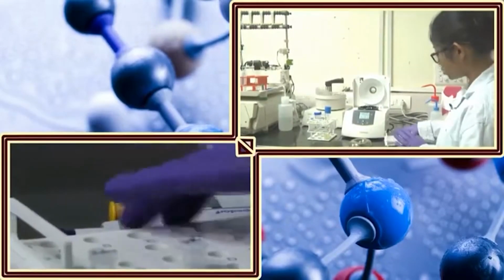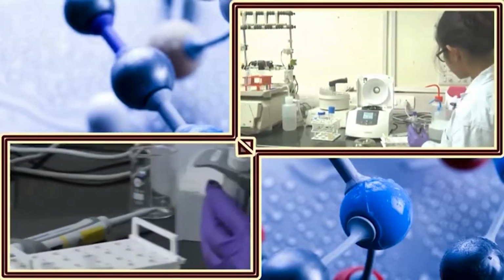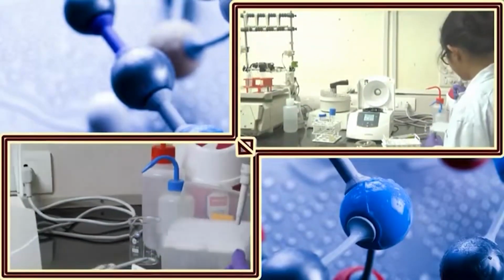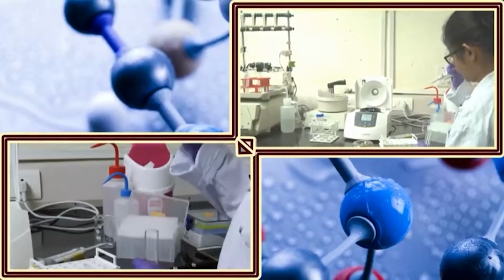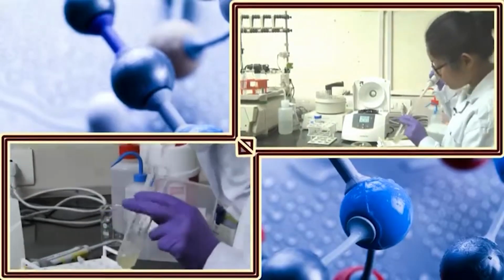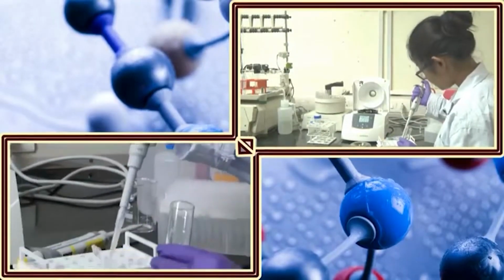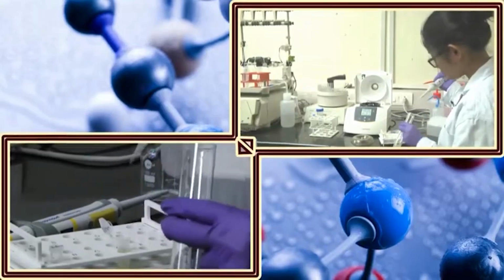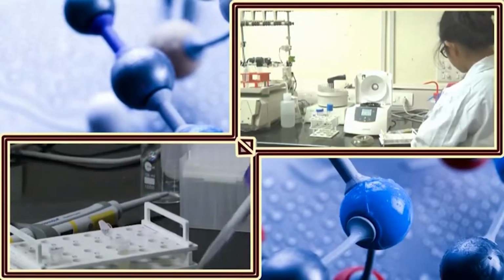So now that I have prepared the two tubes beforehand, I will start taking culture from the tube. Now as I have mentioned, this small centrifuge tube is around 1.5 ml. So I have to take multiple times from the tube, because in a mini prep kit you can isolate plasmid from 5 to 7 ml of culture. So as I want to take 5 ml of culture, using a micropipette I will take 1 ml first. A small volume. Discard the tip.